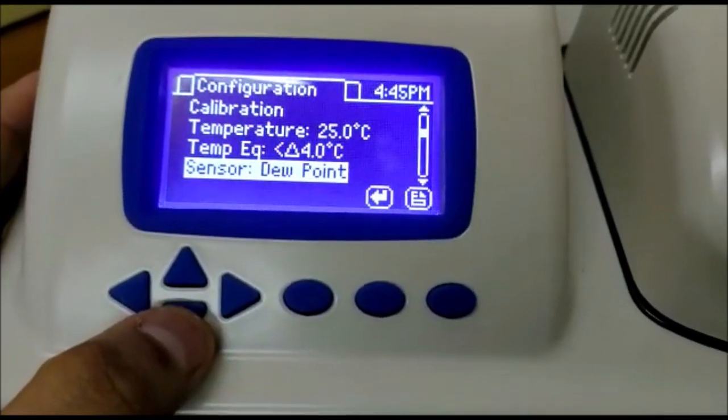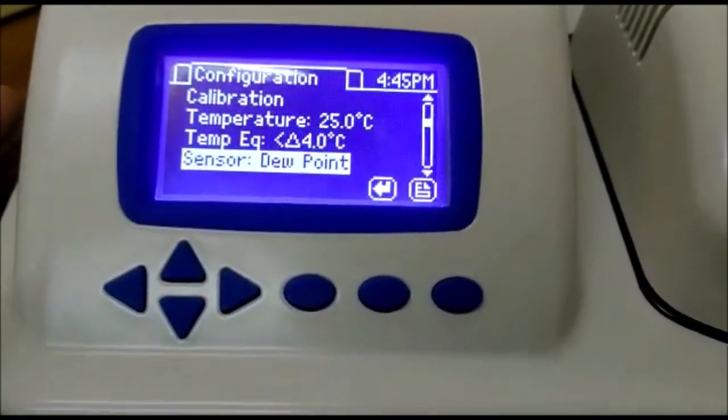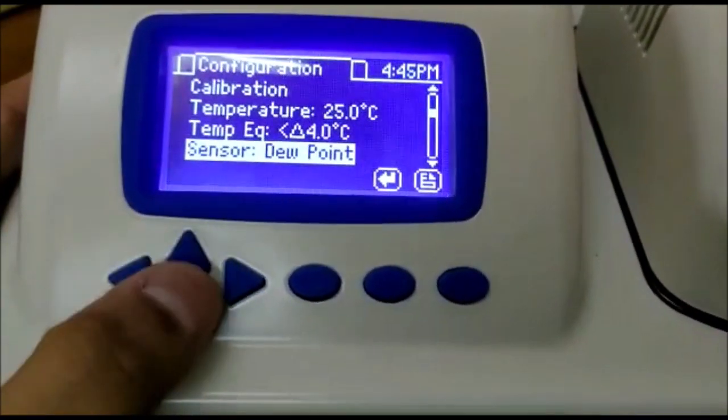Here you can select the sensor type which is only dewpoint in 4TE. There are other models which have two sensors. You can select sensor from here.